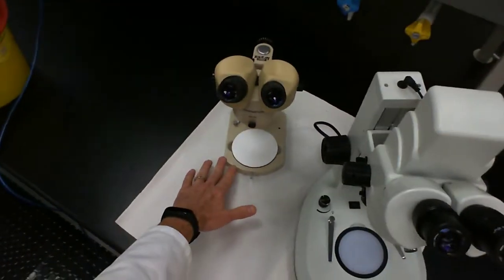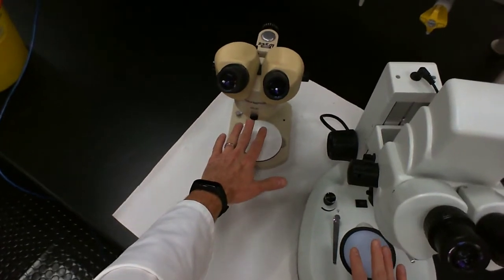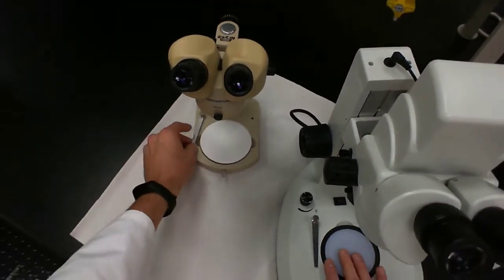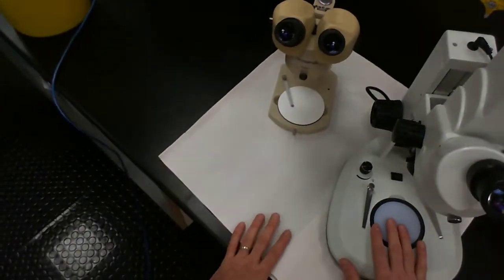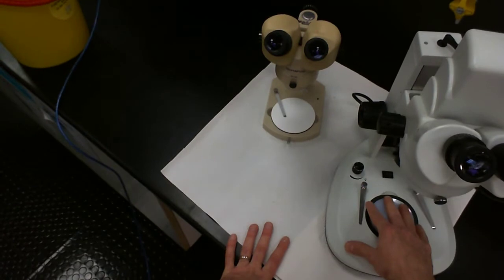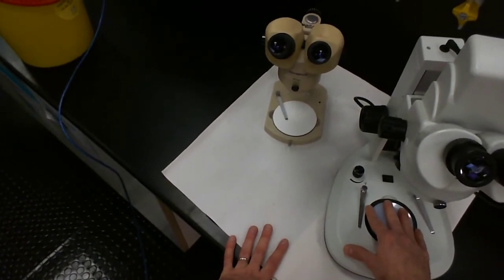There's a base. On the base we have a stage. The stage does have stage clips, though those aren't frequently used because in many cases we're dealing with three-dimensional objects on the stage, and so using the stage clips may not actually be practical.